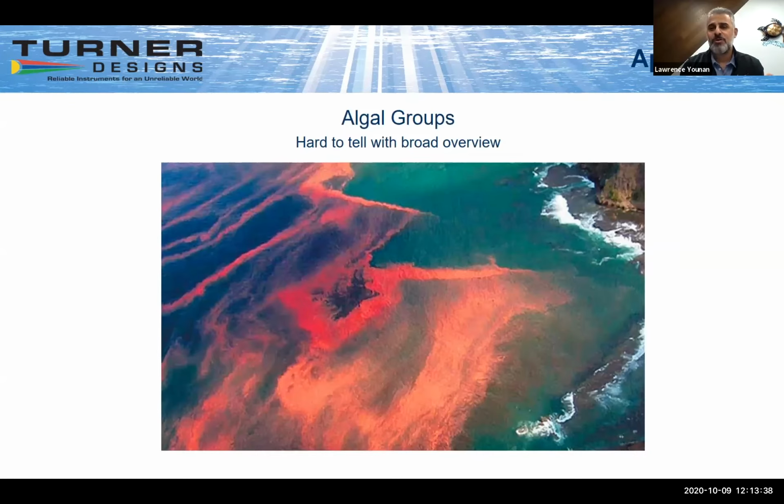That only takes you so far though, right? I mean, you have algal blooms in nature, which you can't access using this type of handheld. A handheld is you collect water from a source, put it in a cuvette, and you put it into the unit to read it. However, you have algal blooms that are offshore. You have algal blooms in areas where you can't really access every single day or be out there 24 hours.